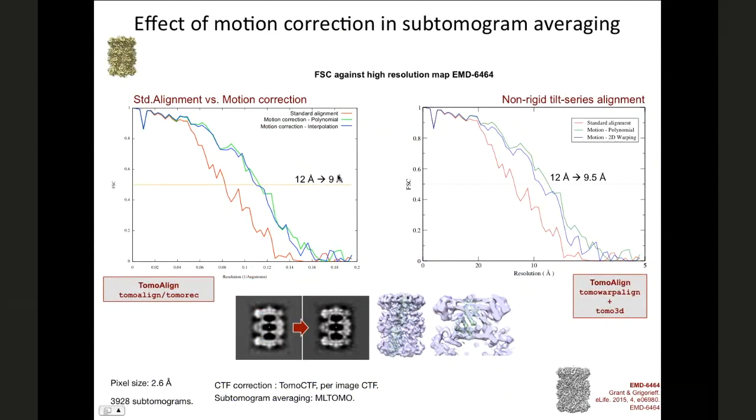We also carry out the warping approach, and we also observe an improvement, but since this approach is an approximation, the improvement is not so high, but still it's very valuable. It may be useful, particularly because this approach is very simple and very fast.